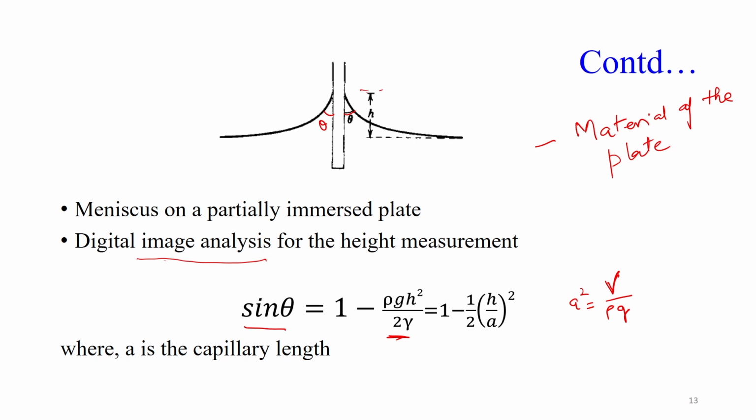One, it should be bioinert with the liquid. If you remember, when we measure the liquid vapor interfacial tension, there are two conditions. The material should be inert, it should not chemically interact with the liquid. At the same time, it should be lightweight. So, although theoretically we can calculate, because of this complexity we mostly go for the goniometer if we want to analyze the contact angle, and we go for the tensiometer if we analyze the surface tension.